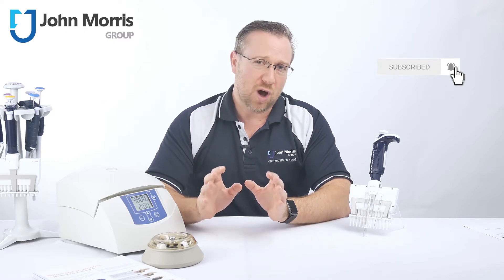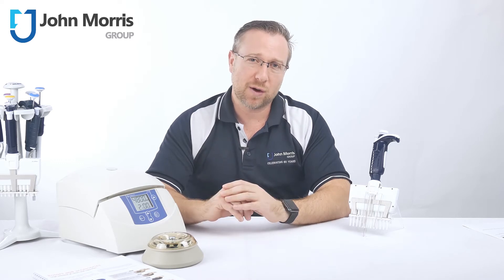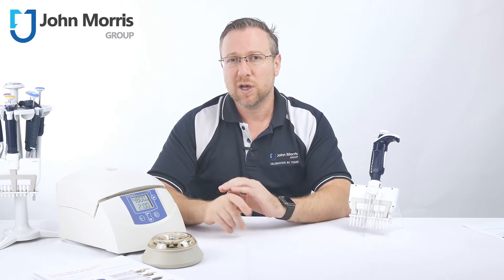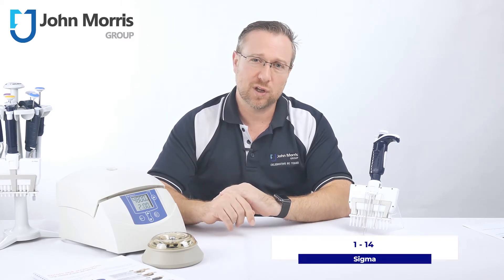If you're working in an isolation RNA, DNA, or protein lab and you're spinning micro tubes — say 0.2 or 2 ml tubes — you're going to want to pay attention to this next little clip on the 1-14 from Sigma.